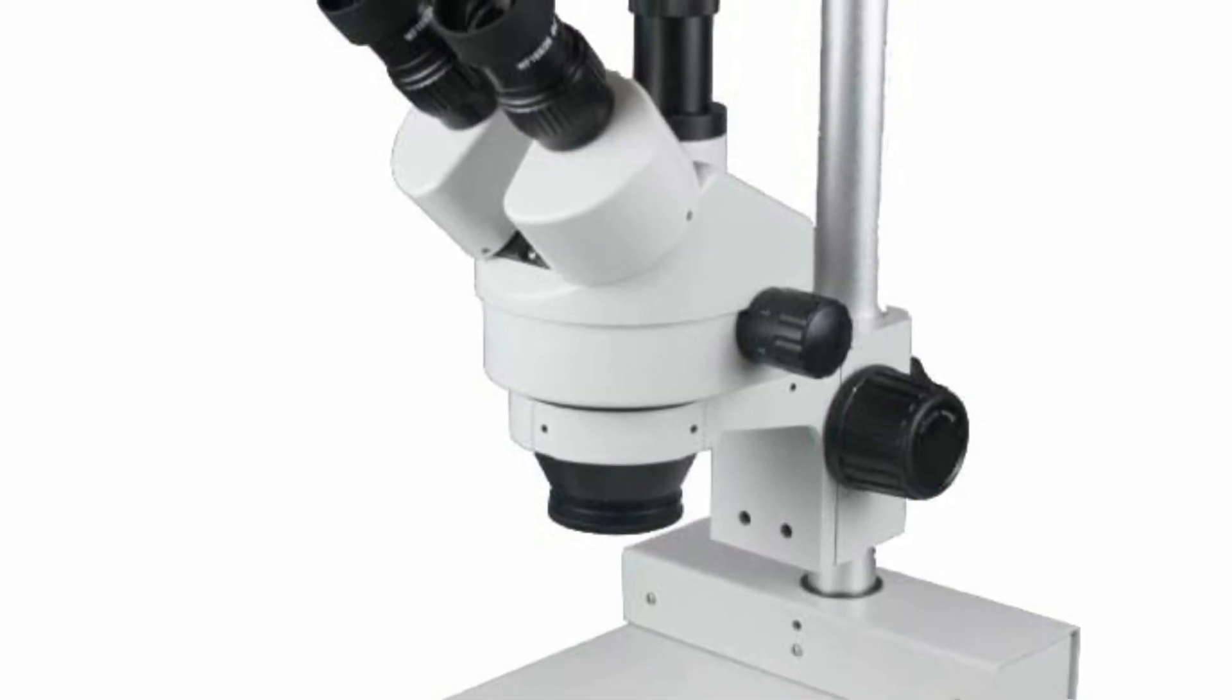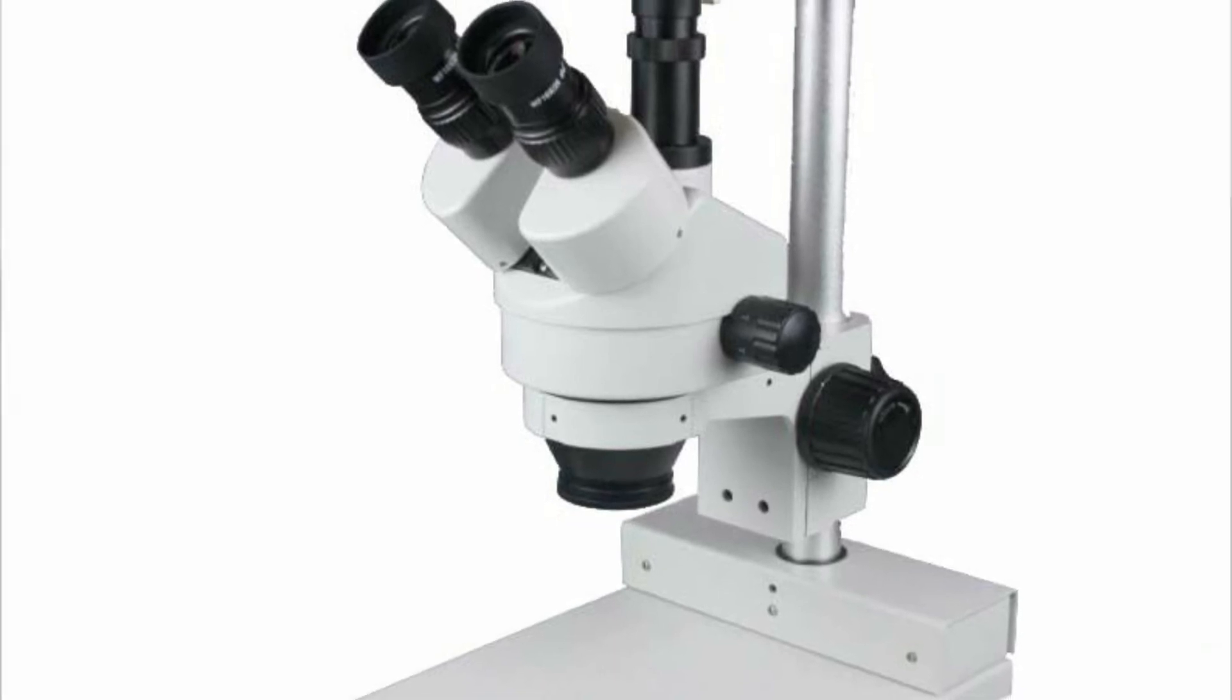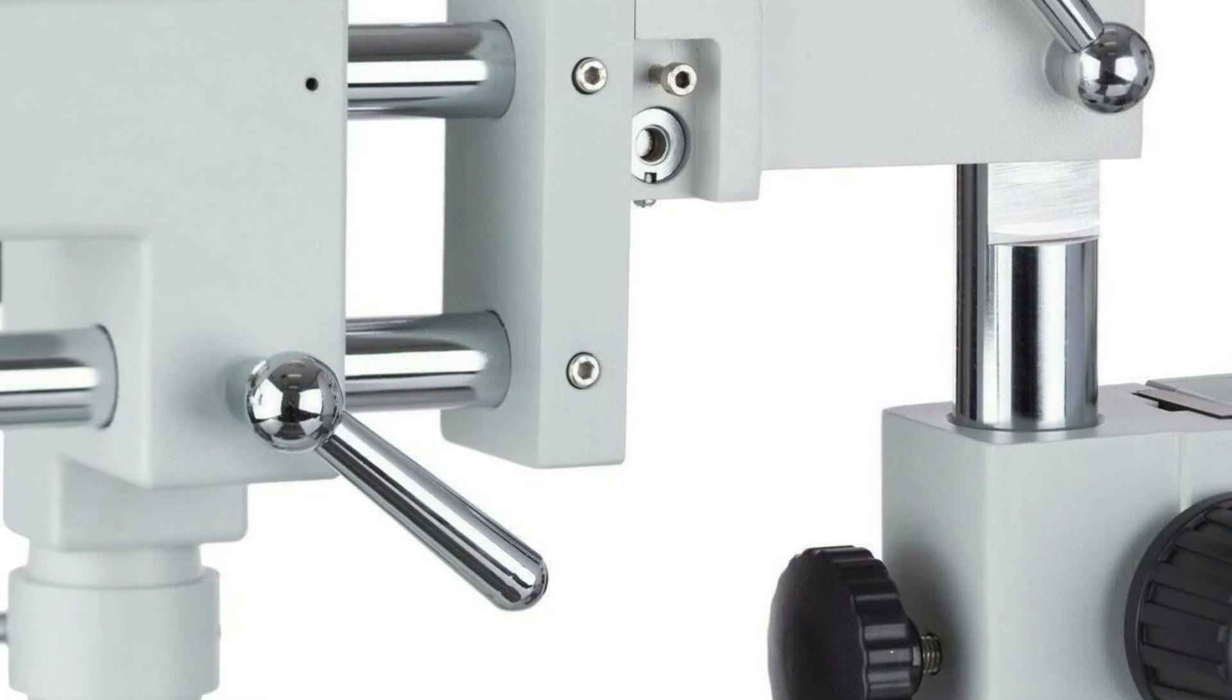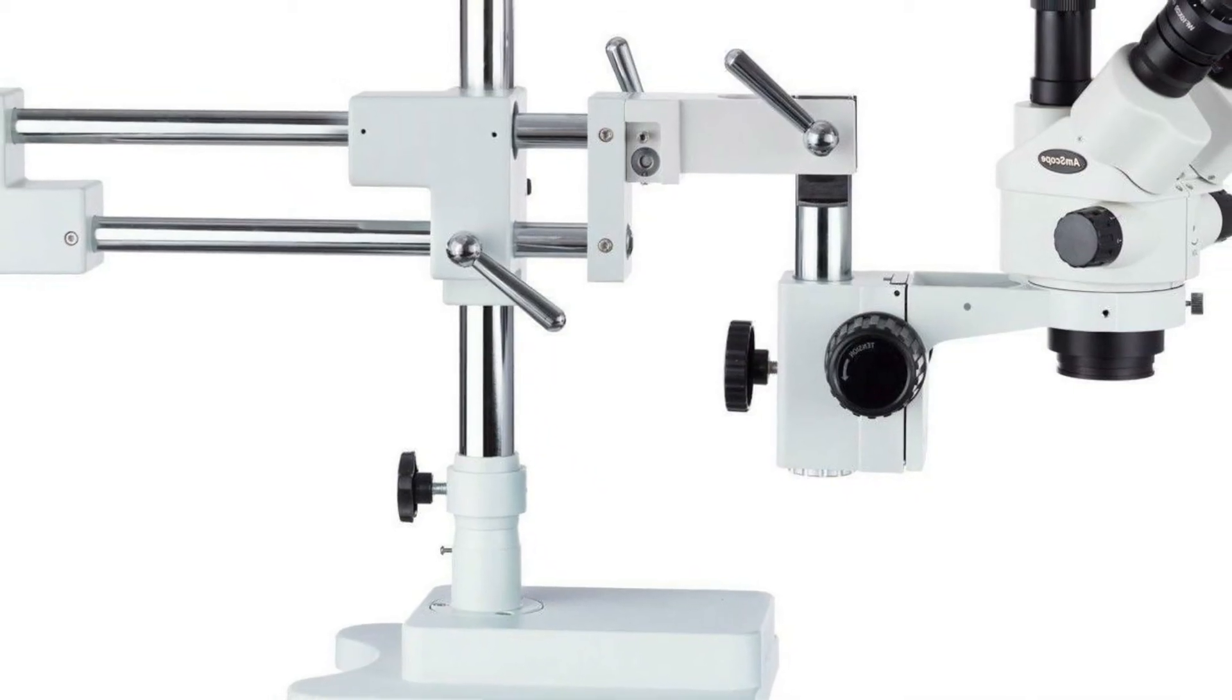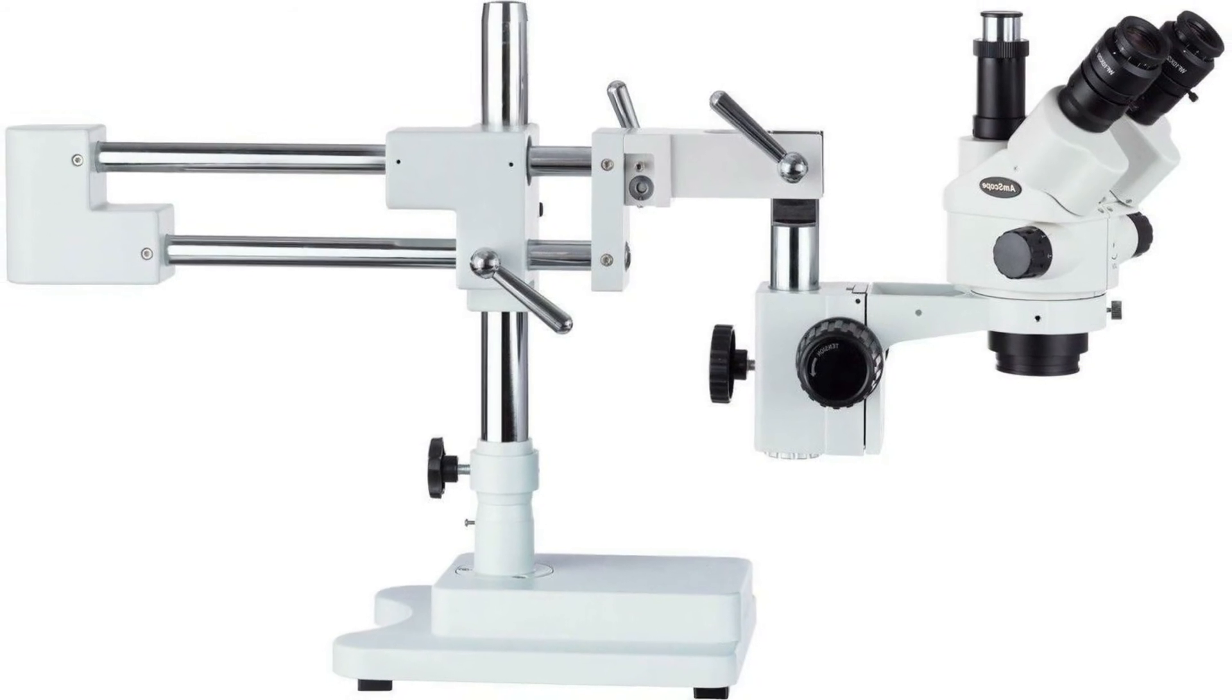This is accomplished by sharing the left objective lens with the left ocular and the photo port. This microscope uses the CX series trinocular port, which can be easily replaced with optional C-mount ports to match specific cameras.